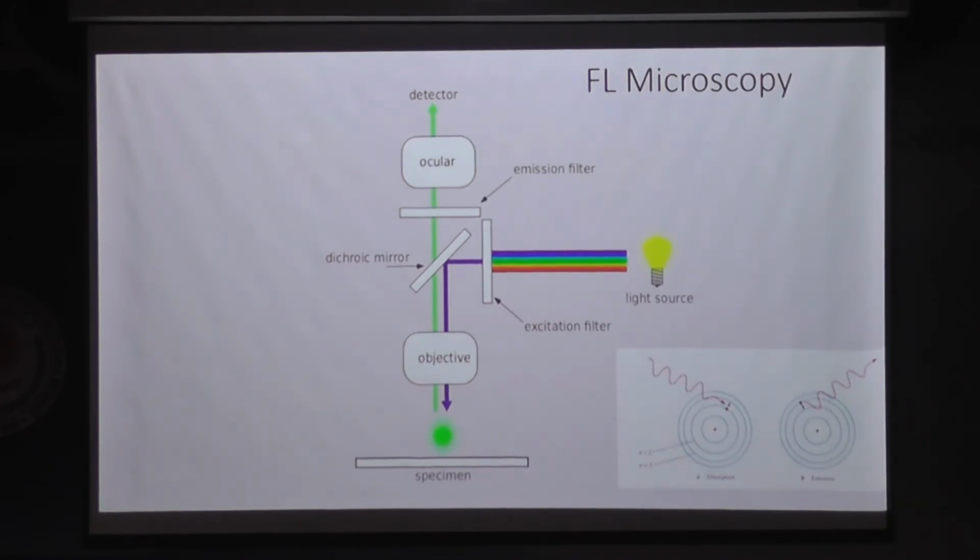Whenever light is incident onto a probe, the atoms in these probes absorb the light, because light is a source of energy for them. They get energized. Once they get energized, they become unbalanced and move to the next orbit. Once they get into the next orbit, they are pressurized to come back to their own place, and they will again come back to their own place.